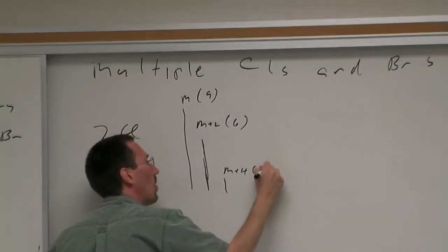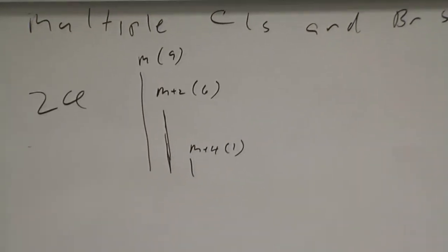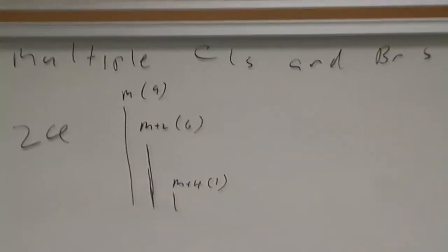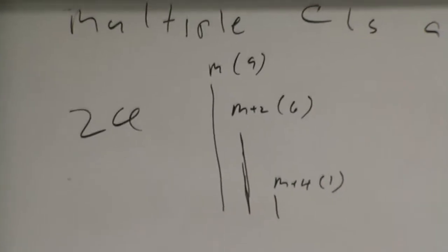So much of spectral analysis is about pattern recognition. It's not about numerical analysis like a computer. It's about looking at something, and the human brain is fantastically good at picking out patterns. And you look at something and you say, hey, this looks interesting.